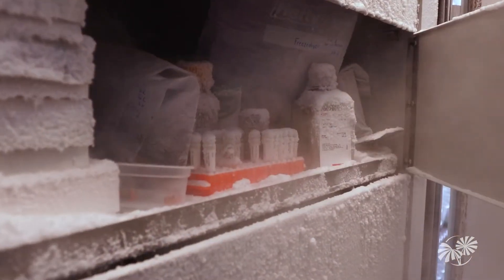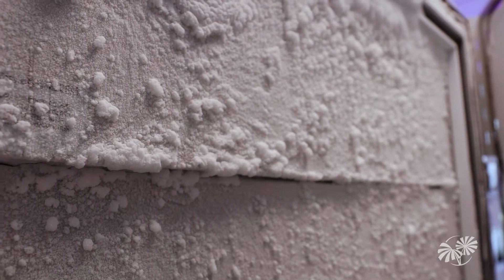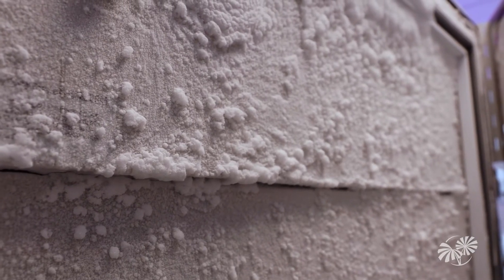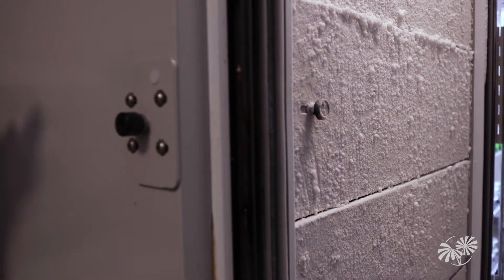This refrigerator will store DNA and plant seeds at minus 80 degrees Celsius — about four times colder than your commercial freezer at home. In here, we can store seeds we think indefinitely under the proper conditions.